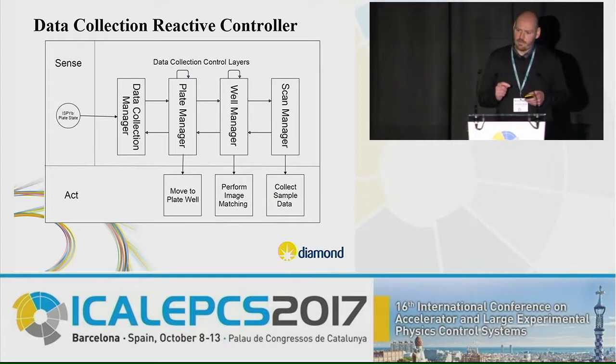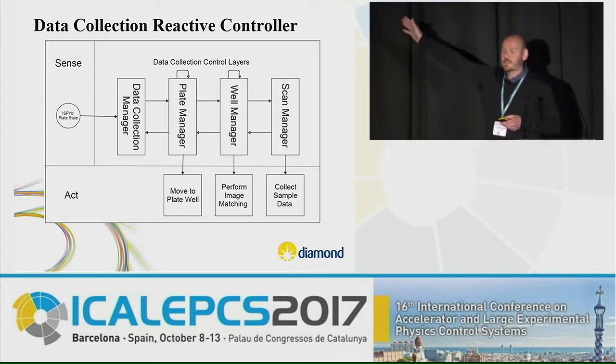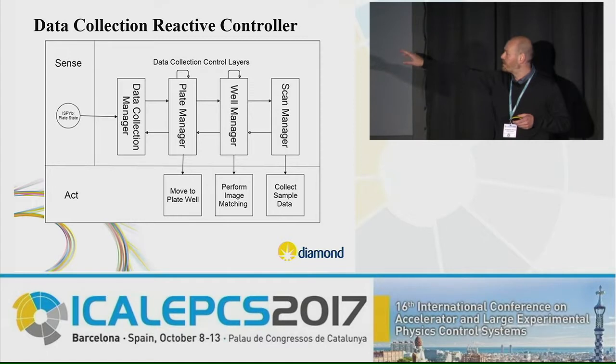The high-level algorithm is designed by the Beamline staff, and this is just an implementation. Each control layer there is an implementation of one of the steps in their algorithm, and what we actually do is execute a sequence of tasks within those particular control layers, in order.